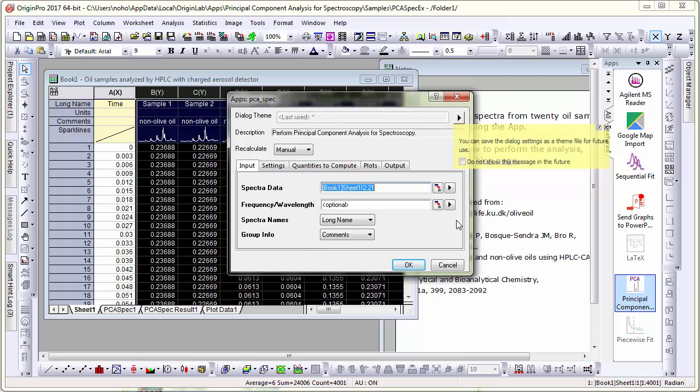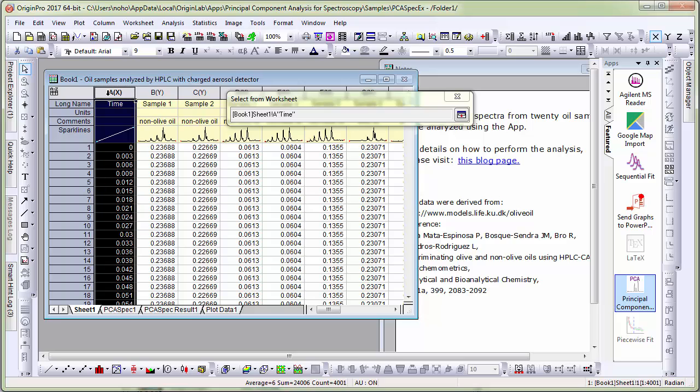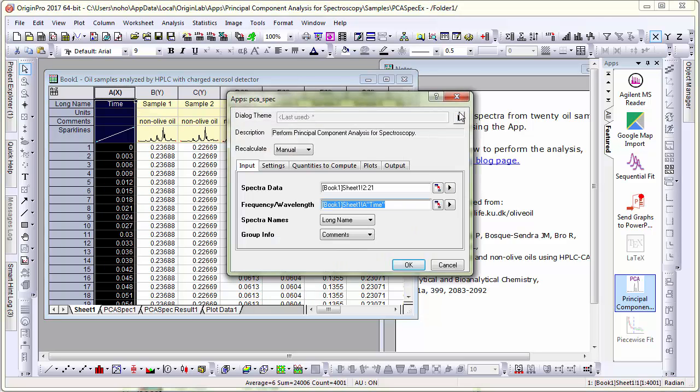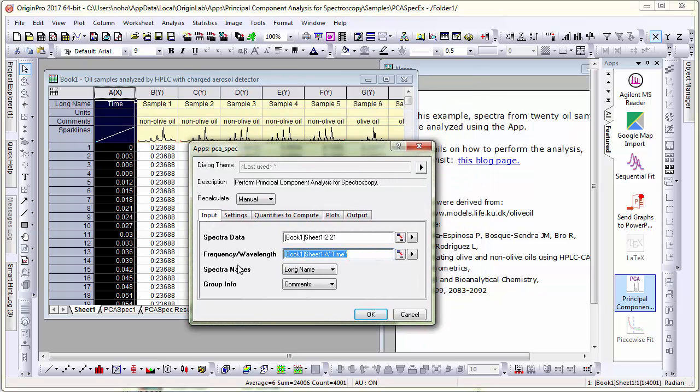Then for the frequency wavelength control, I will select the first column which in this case is a timestamp. And there are several other controls in this dialog. One key control in this panel is the group info.